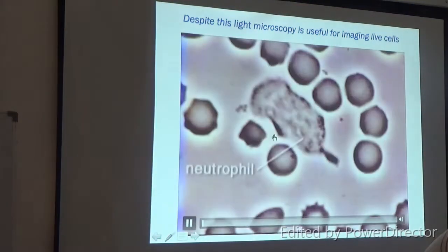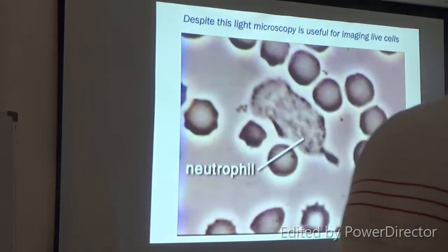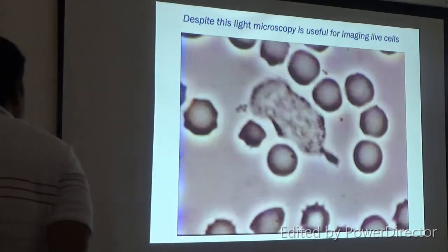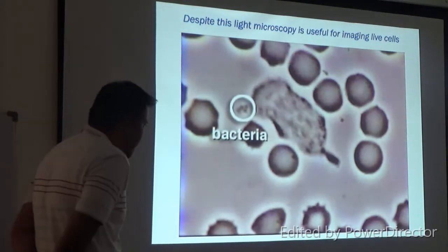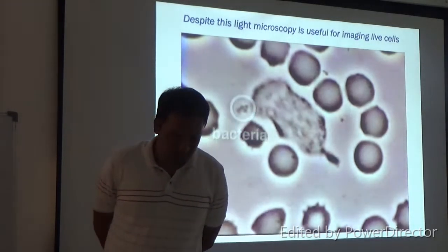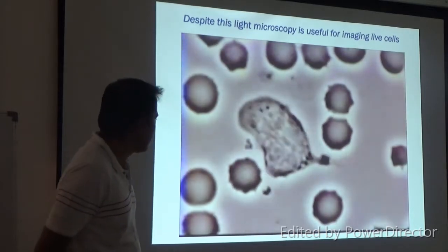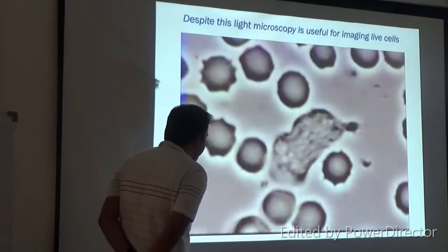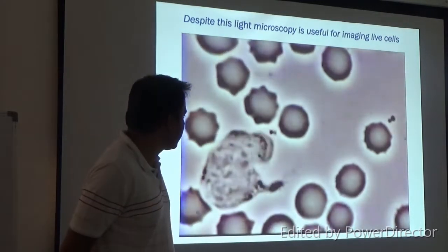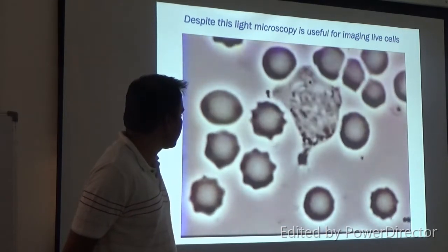Neutrophils are white blood cells that hunt and kill bacteria. In this spread, a neutrophil is seen in the midst of red blood cells. Staphylococcus aureus bacteria have been added. The small clump of bacteria release a chemoattractant that is sensed by the neutrophil. The neutrophil becomes polarized and starts chasing the bacteria. The bacteria, bounced around by thermal energy, move in a random path, seeming to avoid their predator. Eventually, the neutrophil catches up with the bacteria and engulfs them by phagocytosis.